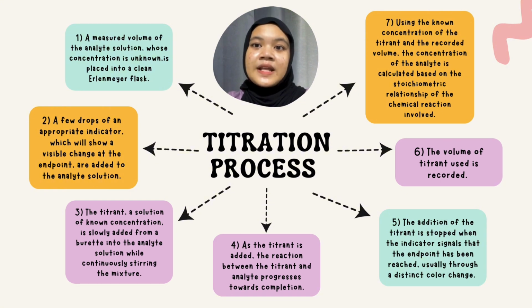For the sixth step, the volume of titrant used is recorded. And for the last step, using the known concentration of the titrant and the recorded volume, the concentration of the analyte is calculated based on the stoichiometric relationship of the chemical reaction involved.